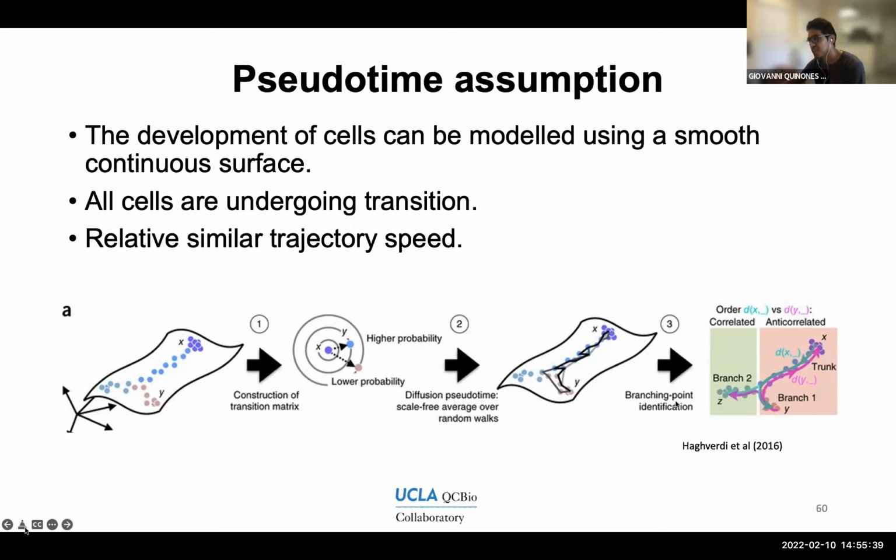Or is there some branching going on, where your original cell population starts differentiating into two or more different types of cells? This branching analysis is also determined by the software that you're using, by analyzing this trajectory graph in the first place.